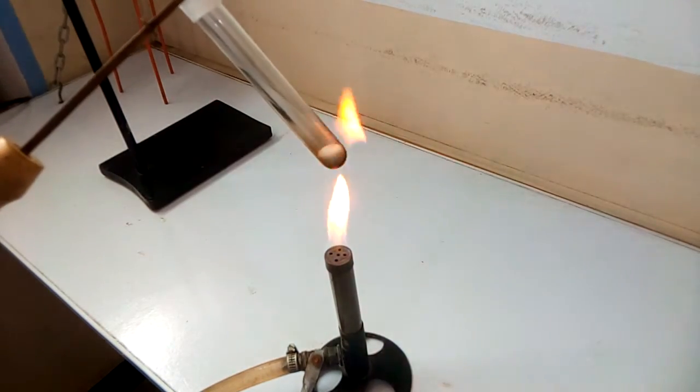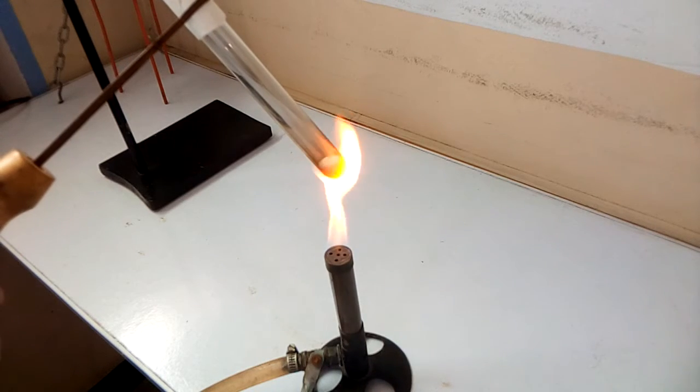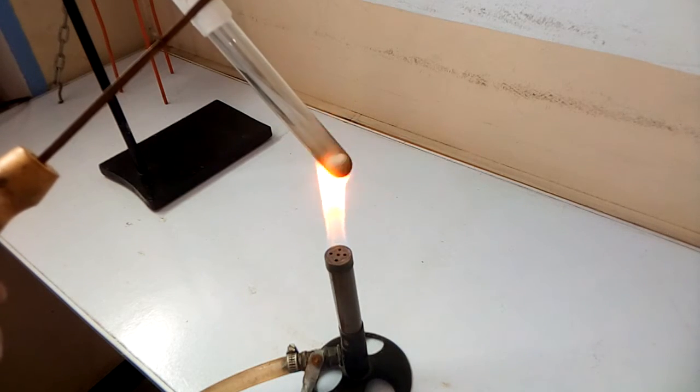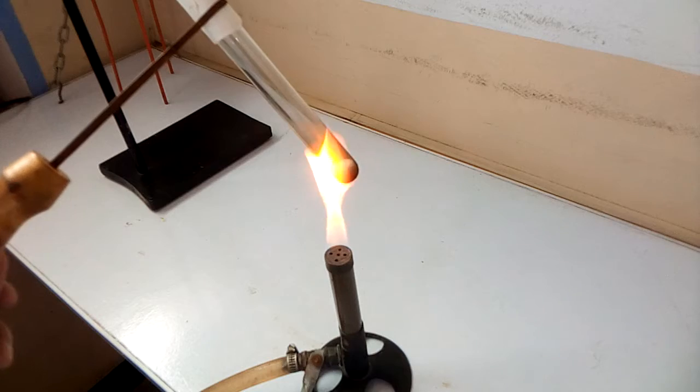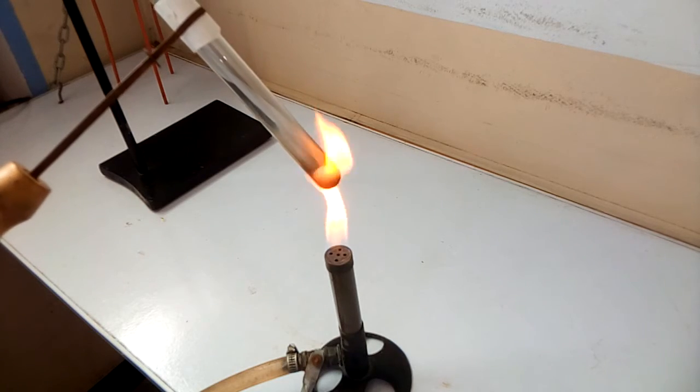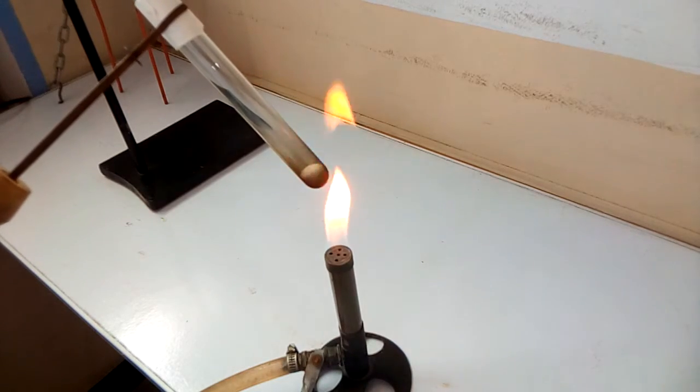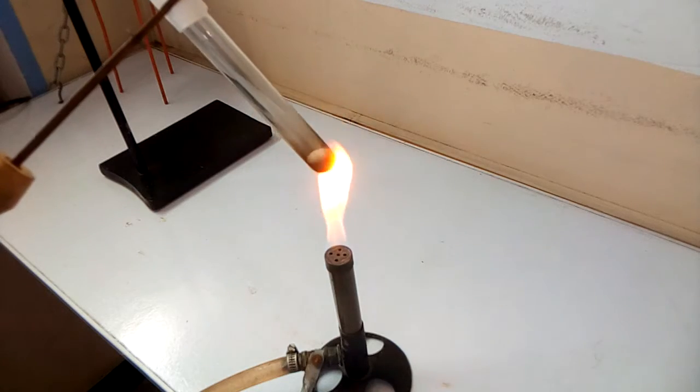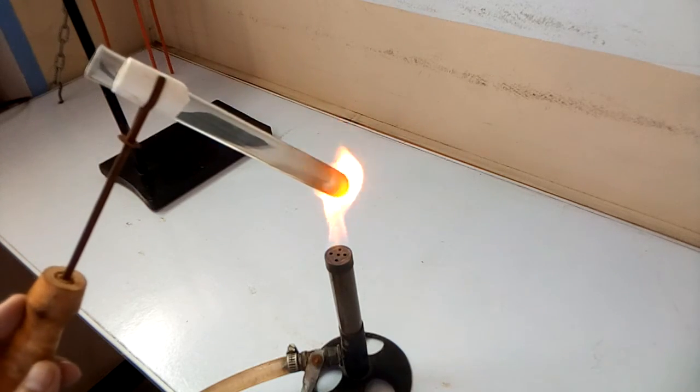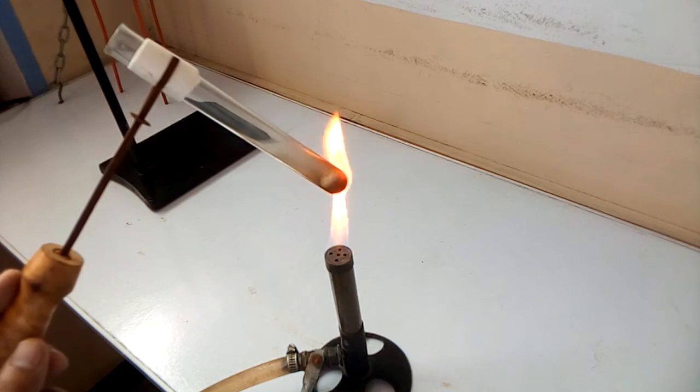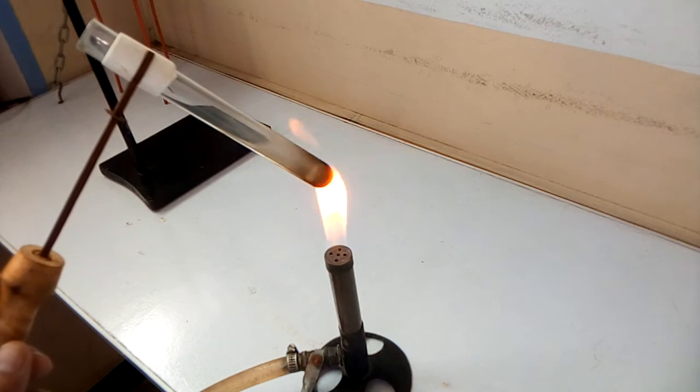You will see that ammonium chloride will sublime in the form of white fumes and will solidify on the cooler end of the test tube near the wrapped filter paper, or you can wrap it with cotton also.